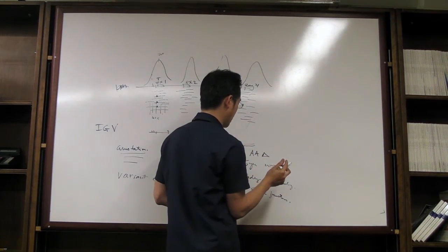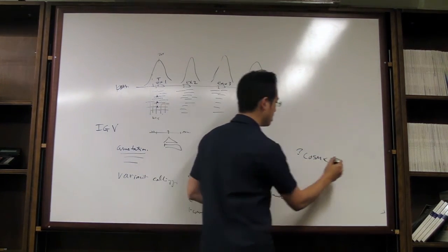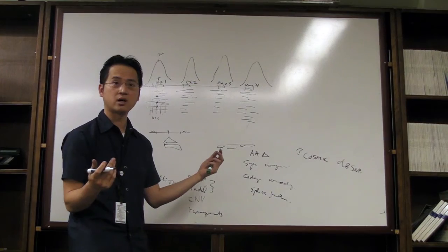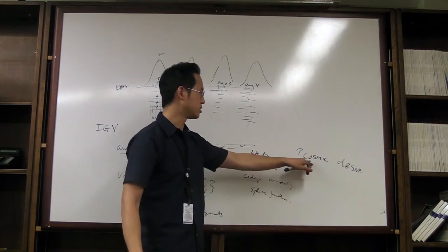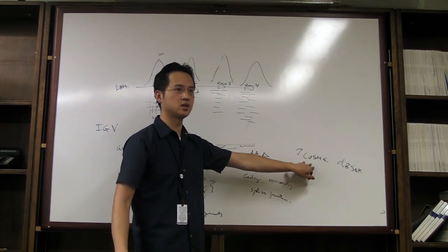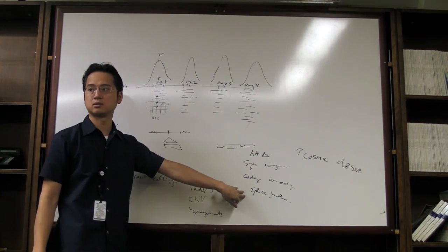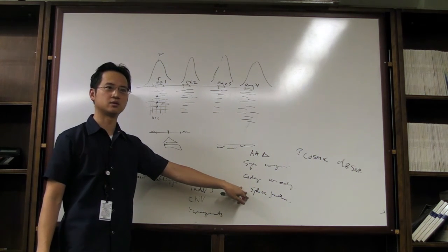And let's say, have I seen it before in Cosmic? You can annotate that way. Do I see it in dbSNP? Is this a SNP that occurs very frequently in the population? For example, EGFR has a very common SNP that we don't worry about whatsoever. But if it's not a SNP, and it is in Cosmic, and it has been shown to be causative of disease, now via a complete annotation, you can go through and make a diagnosis. It's very different, right? Very different from traditional sequencing.